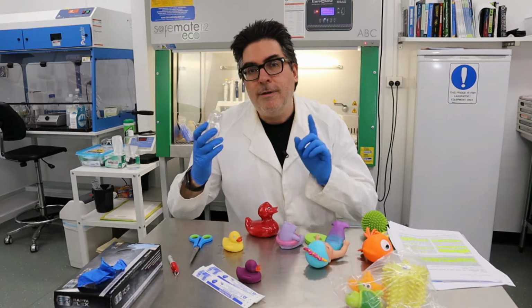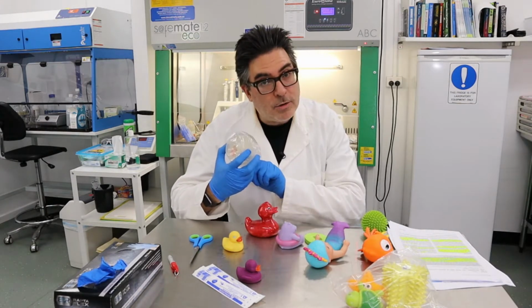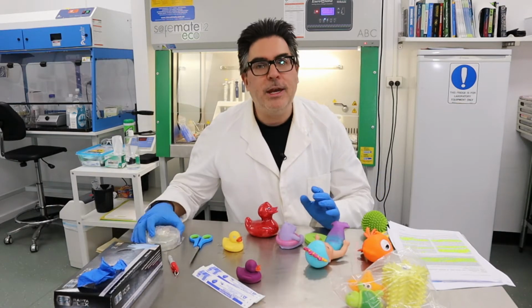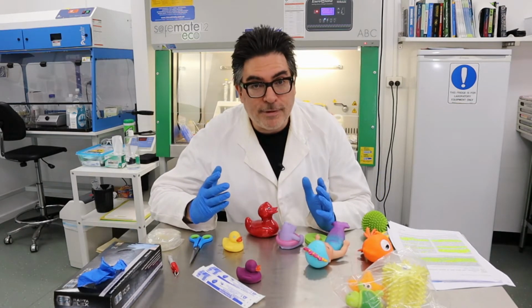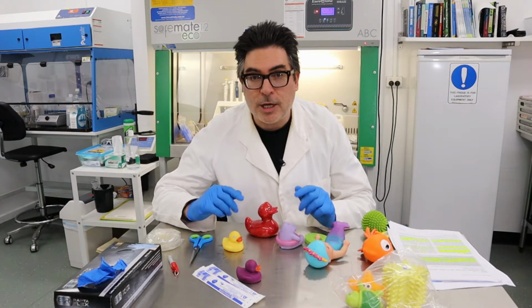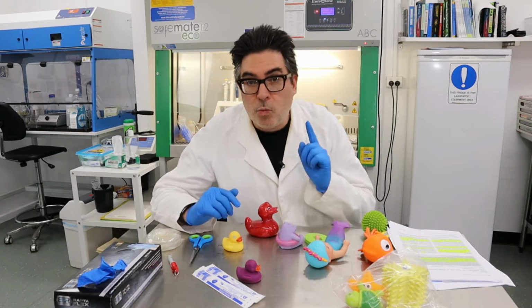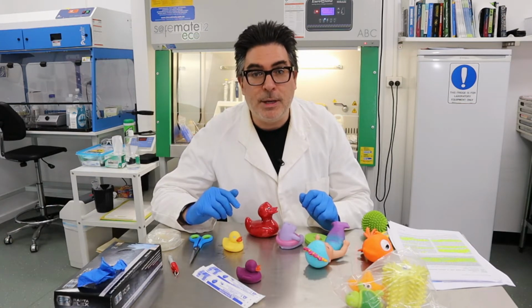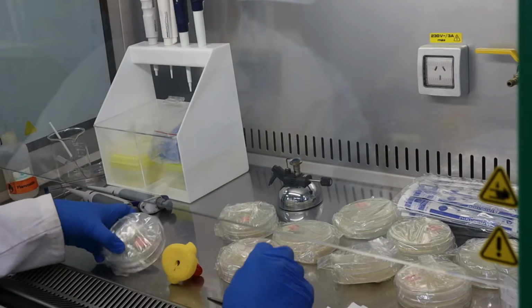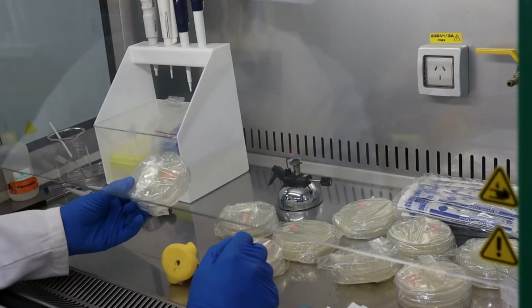And so firstly, I want to find out what is going to grow on this subset of toys, what we can find, and then I'm going to talk to you about biofilm formation, what the academics have found in their research of this phenomena, and then what you can do to make bath time a little bit safer for you and your family. So you'll see I've got my sterile Petri plates here.